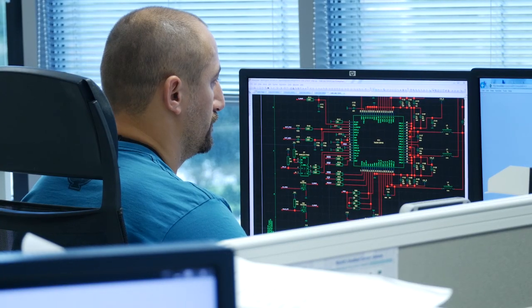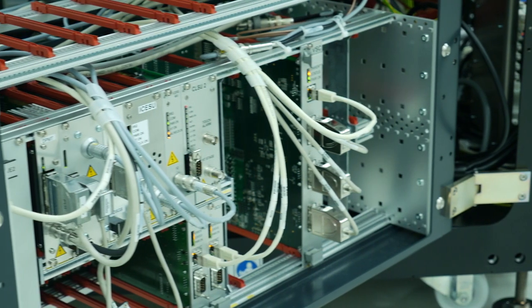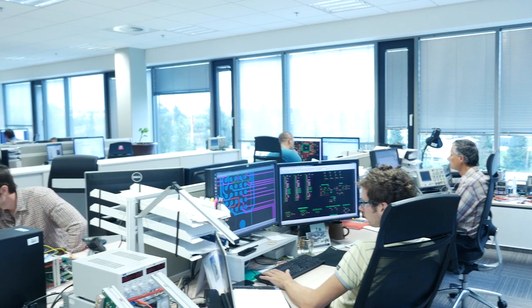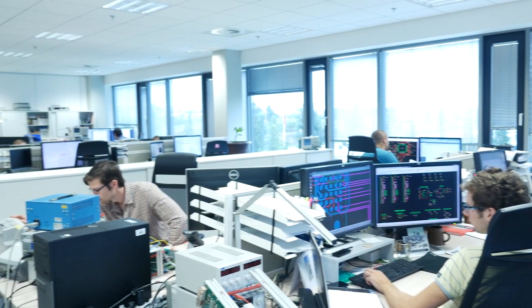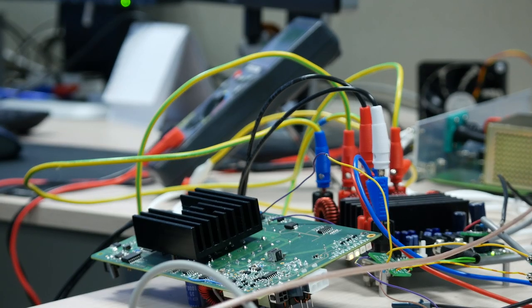The stability of these sources in the microscope is required to be within 1 to 10 ppm. In other words, it must not change more than between 100,000th and 1 millionth of the setup value over a specific time and temperature range. This makes my head spin.